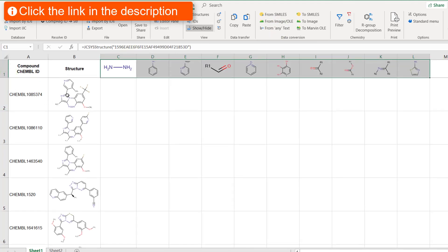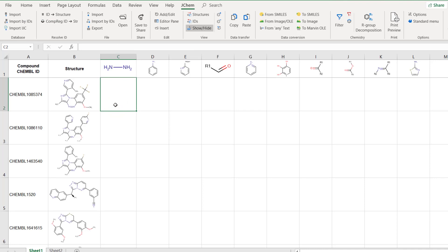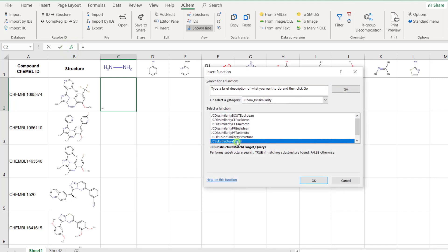In a previous video of the series you can learn how to do this by substructure based filtering. But this video is about another solution based on the JCSubstructureMatch function in JChem for Office. This function checks if a target compound contains a query structure and gives true or false as an answer.